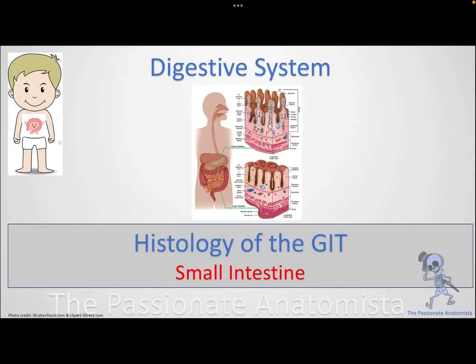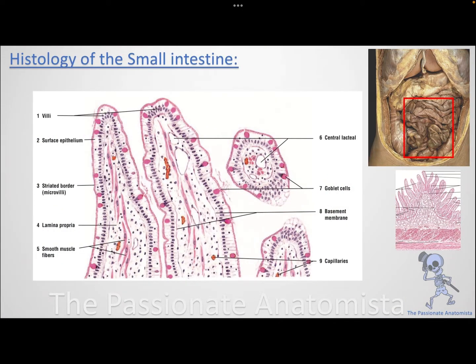In this video, we're going to talk about the histology of the small intestine. Now you have a broad idea and a lot of information about the GIT, and this video is going to be very simple because you've learned everything in the previous one. We're just going to see more pictures and learn how to identify between different parts of the small intestine, and you know them: they are the duodenum, jejunum, and ileum. Now into more details about the small intestine itself.